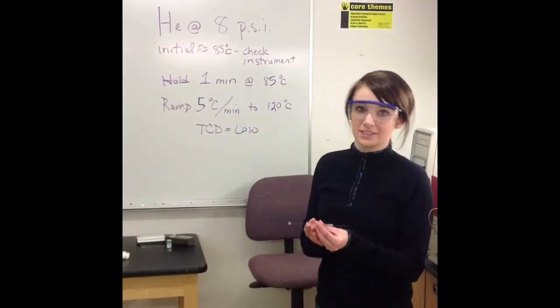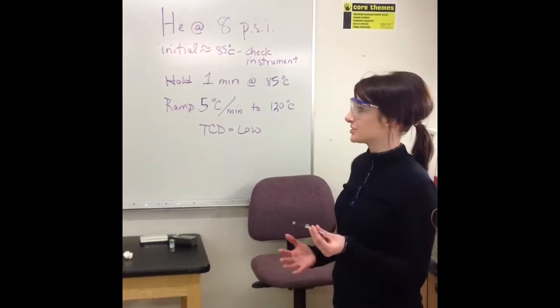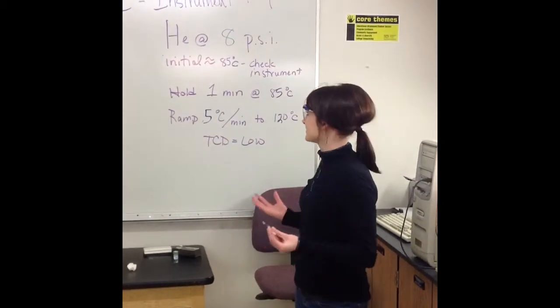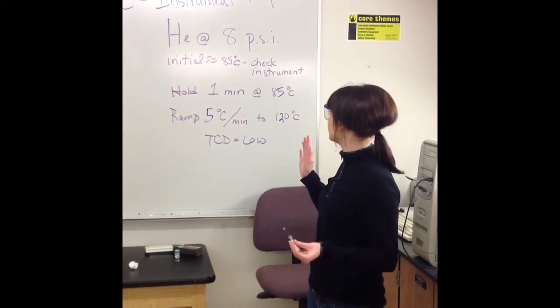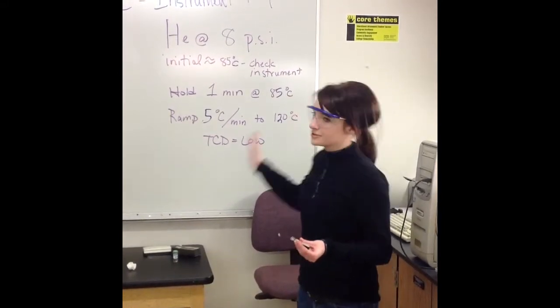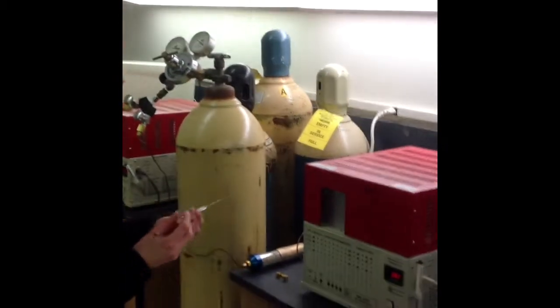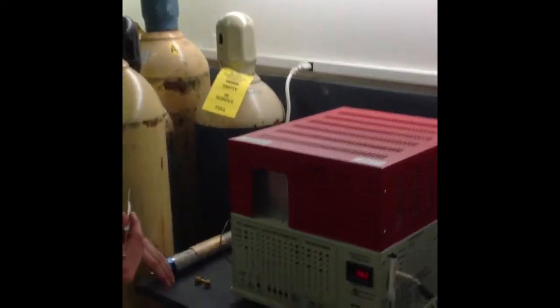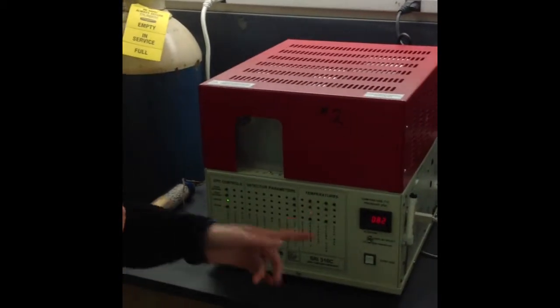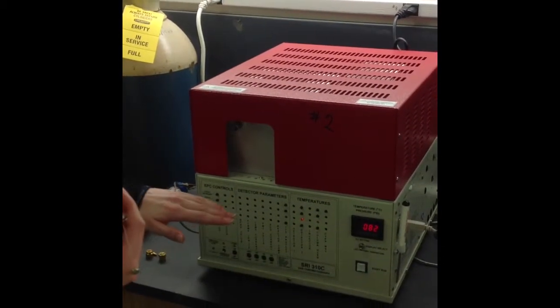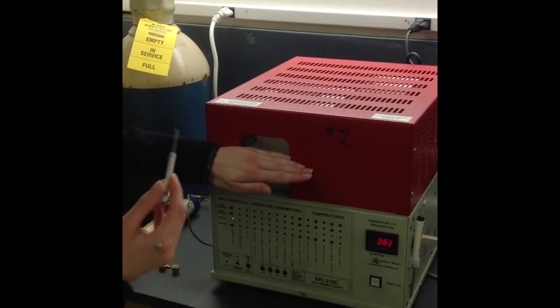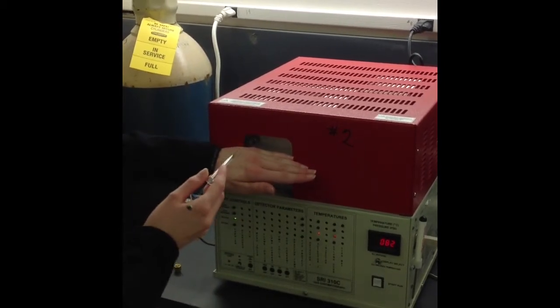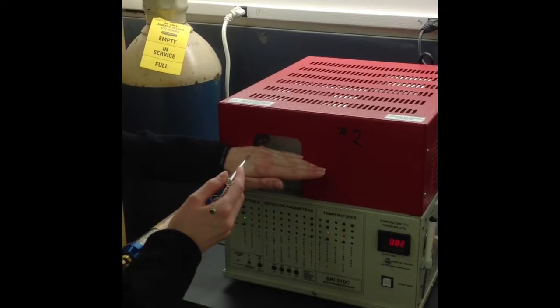Now I'm ready to inject my syringe. But first of all, you want to make sure you know your operating parameters, and that can vary based on the compound or the column. So here are ours. And so now I can go over and I can inject. First thing you want to make sure that you do is you'll record the temperature.